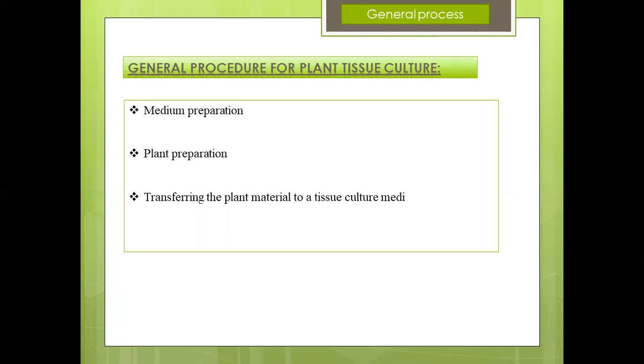Agar is added to the medium, heated and stirred to dissolve. After cooling, the warm medium is poured into polycarbonate tubes. With lids sitting on, the tubes are placed in a pressure cooker and sterilized for 20 minutes.